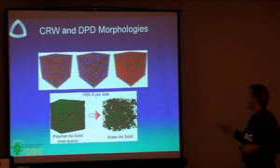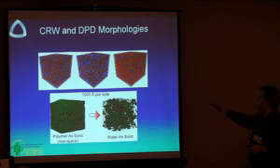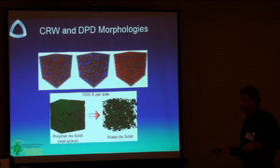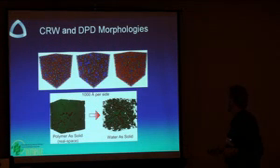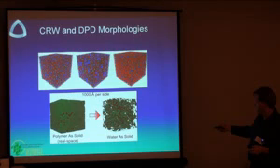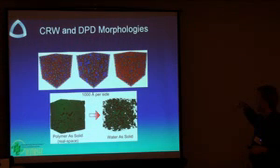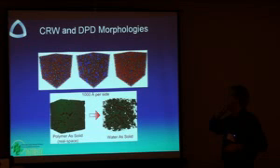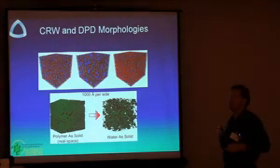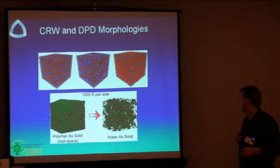And so this is something that was developed by my student Nick Aida. It's basically a clipped random wave morphological representation of a SAXS image. This is not a unique solution. It is basically a very, very possible solution. And the reason we got bold and published this is simply because it matches almost the same morphology that is predicted by the dissipative particle dynamics model, which was first implemented by Toyota and more recently by Stephen Patterson.